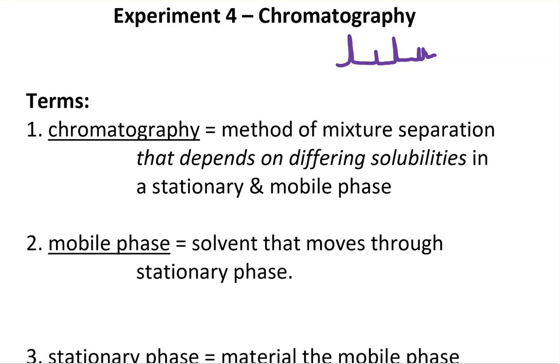the fire, and then they compare that to the same kind of signature from like a source of gasoline in some person's garage or something like that. And what's happening with this is that each of these little peaks, when you see this, is a different compound. So gasoline is a mixture, and by separating them out, the relative heights of these tell you how much of each compound, and the pattern of them helps to identify it. So that's a kind of chromatography you may have seen before.